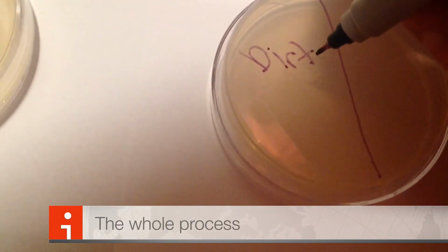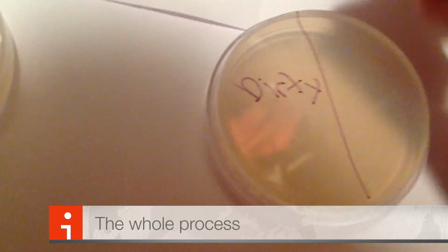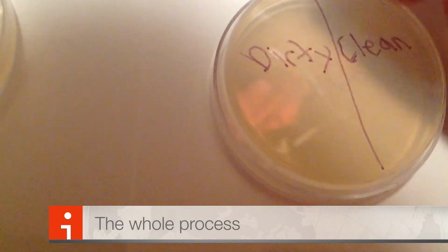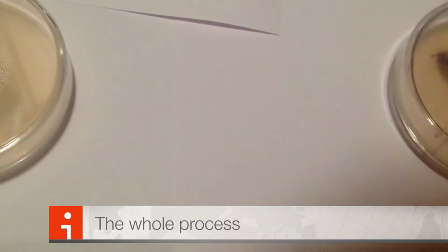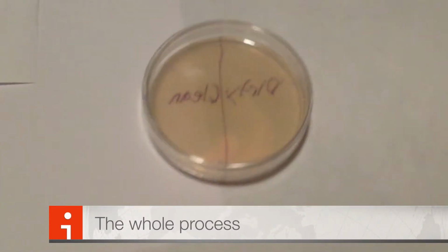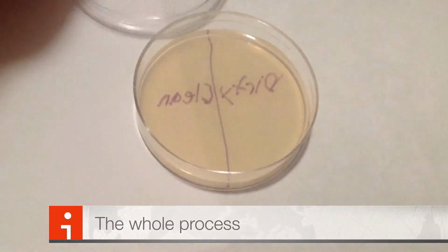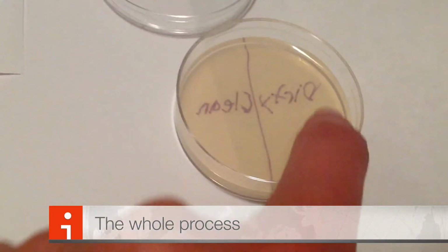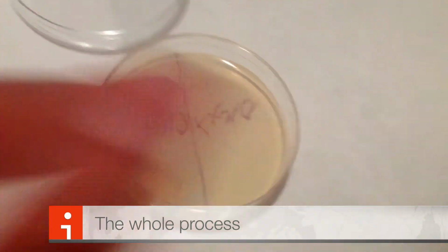So while you watch the process as it happened, I'm just going to explain why I'm doing this experiment. I'm doing it because I would really like to find out how well hand sanitizer works. I mean, every person in the world probably uses hand sanitizer at least every week to clean their hands in the bathroom, anywhere. But the question is, does it really work? Or is it just like a placebo effect that makes you think that your hands are clean? This would be a scientific experiment that would test if hand sanitizer really worked and if all the bacteria is gone like they advertise.